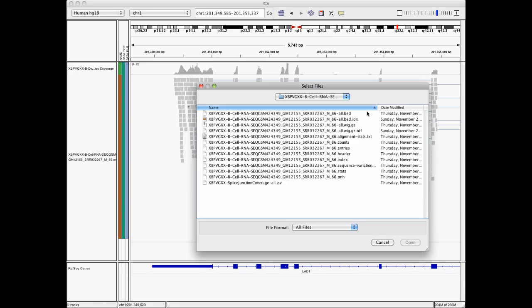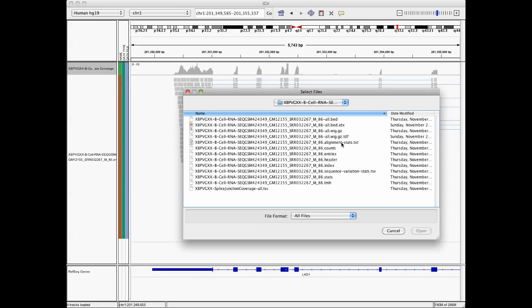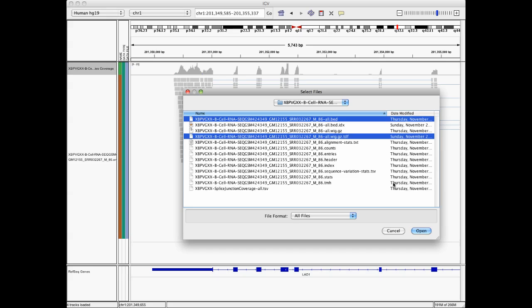The GobyWeb alignment plugin also outputs the BED file as well as a WIG file. Here I've indexed these files using igvtools to create a binary format of the WIG file, TDF. This is for speed in loading, as well as an index file for the BED file. You can also upload those directly to IGV. So here, upload those.